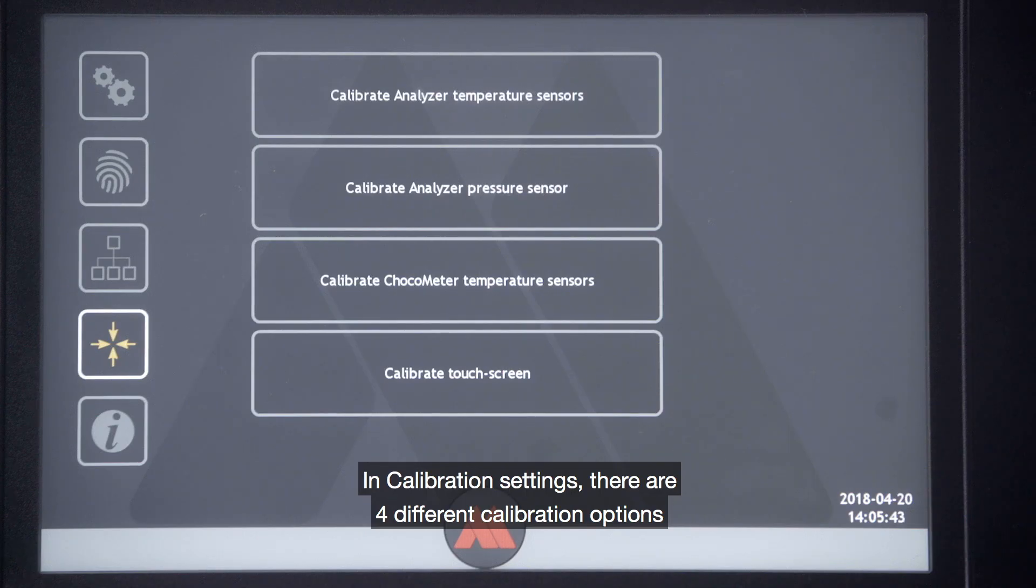In calibration settings there are four different calibration options for every sensor in the instrument.